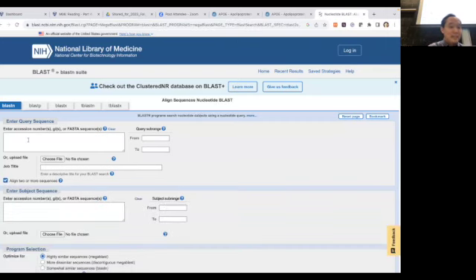So when I do that, I have a query and subject. It doesn't matter where to put which one, as long as you know what you did.